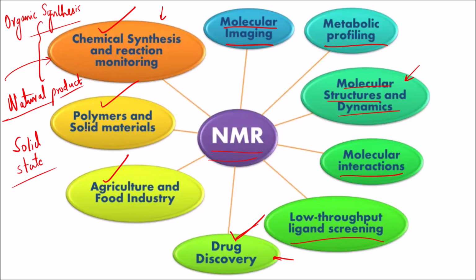So I hope you have understood the basic instrumentation of NMR, how it works, how you prepare the NMR sample, how you load it, how exactly the scanning takes place, and how the data transfers, from loading the sample to getting your data on the computer screen. I hope you have understood that. And that's it for this video.